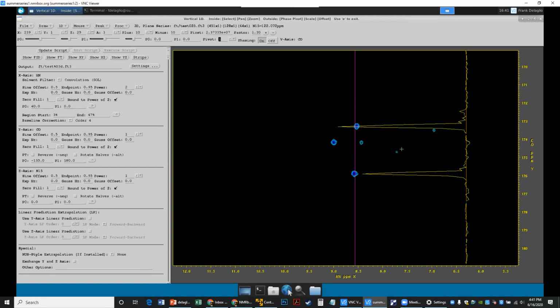And in a typical processing scheme, you actually delete the imaginary part, so you're left with 256 real points, just like in this case. In that case, the zero frequency would be point 129, which pretty much comes to the center of the axis. It's the center plus 1.